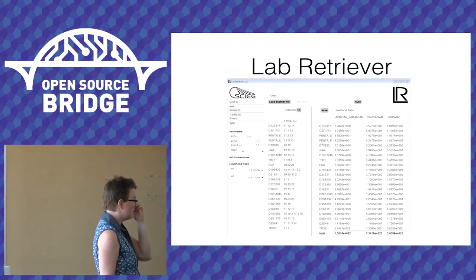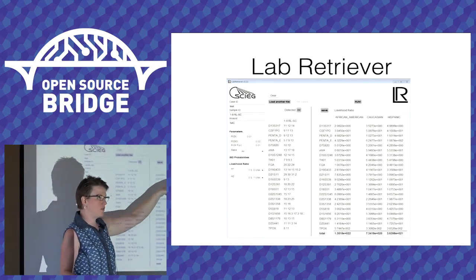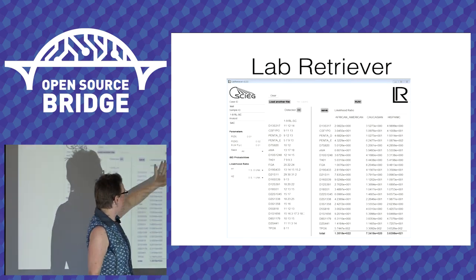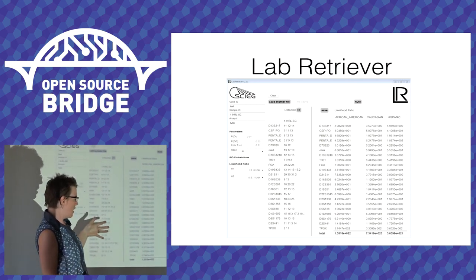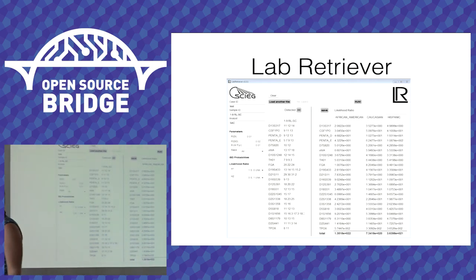And at each locus, it does the likelihood ratio, factoring in the fudge factor with the dropout. It does it for three different population groups, African-American, Caucasian, and Hispanic, that NIST has data for, and it multiplies them together and gives you a final result.